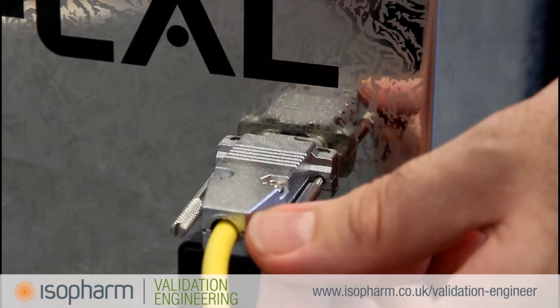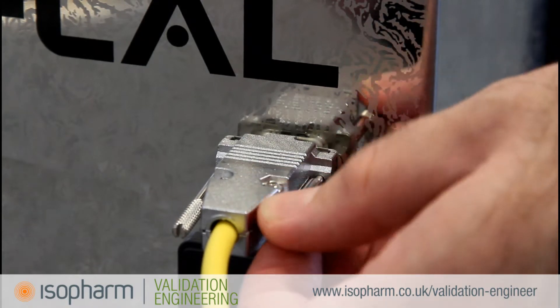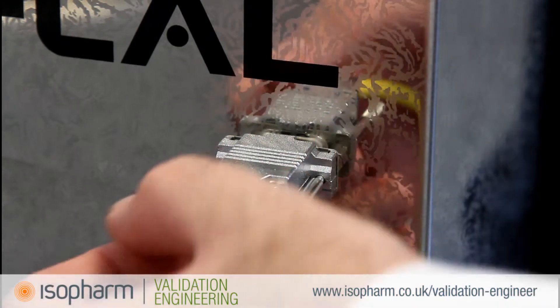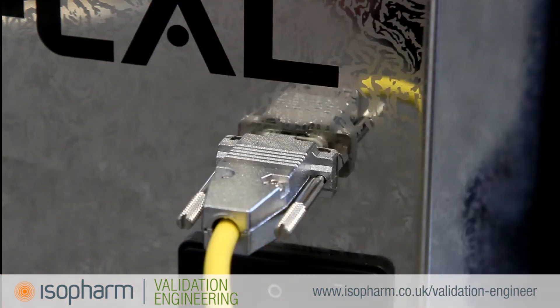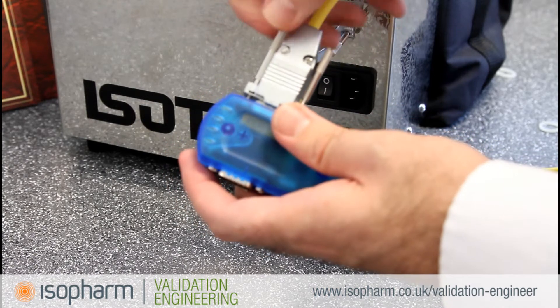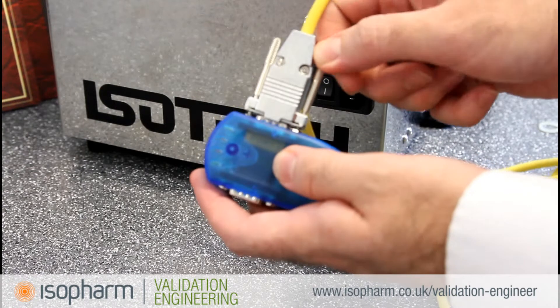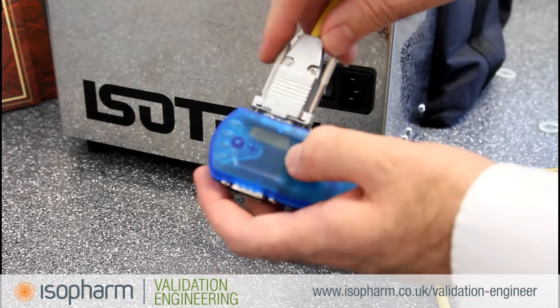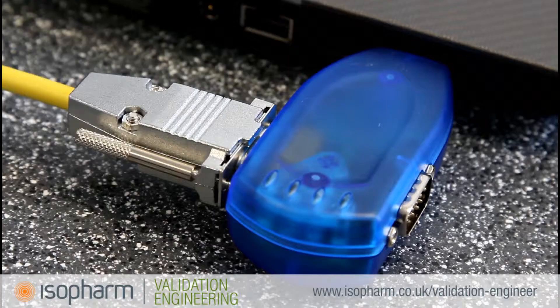If calibration is going to be done using the automatic calibration function in TQsoft, connect the heat reference unit to your PC using the RS232 connector and USB converter. The USB to serial converter is available separately from the Isopharm validation engineering shop.